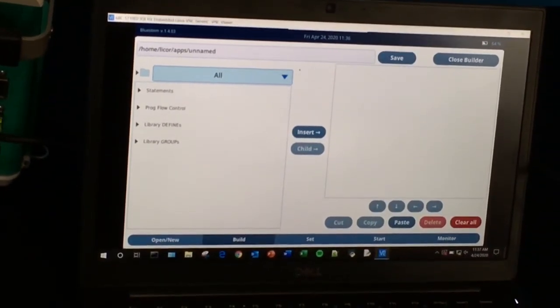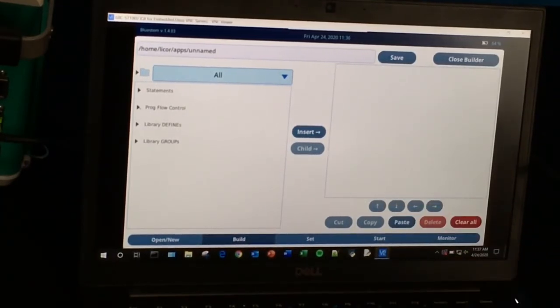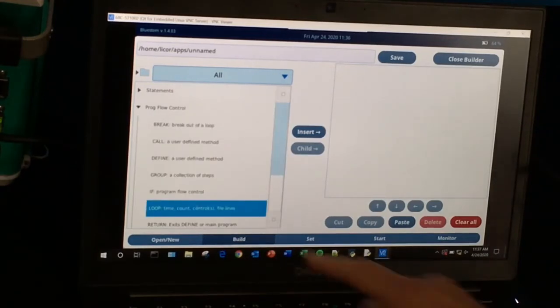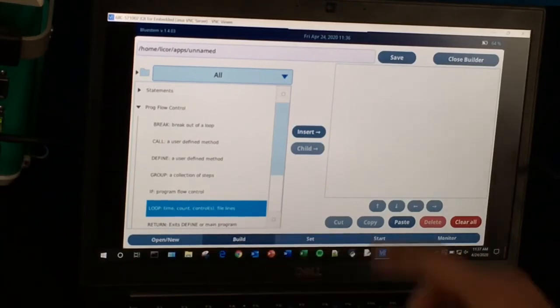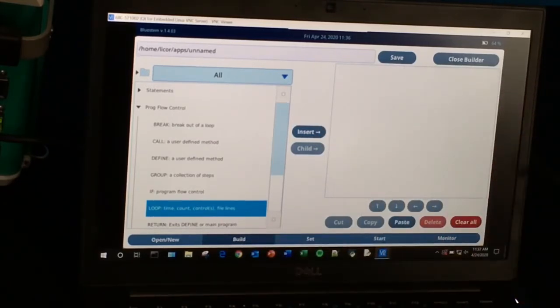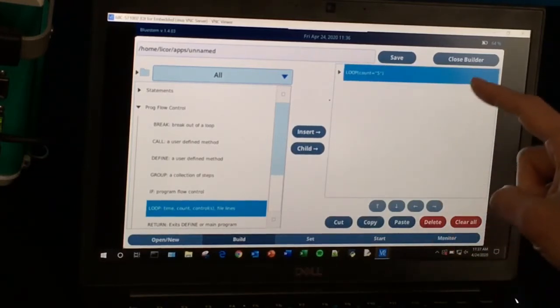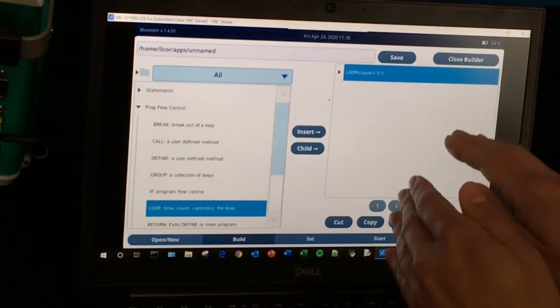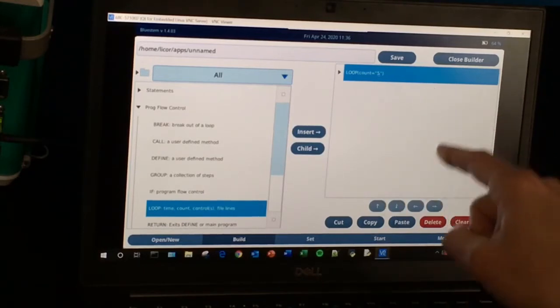We're going to start with a simple auto program that does an auto log. I'm going to use my program flow control and scroll down to find the loop statement right here. Once it's highlighted, I'm going to click the Insert button to get it into my screen. What the loop does is that whatever is inside this loop, it's going to do it for a certain amount of time or a certain number of times. Right now it's set to five, so it's going to go through this loop five times.